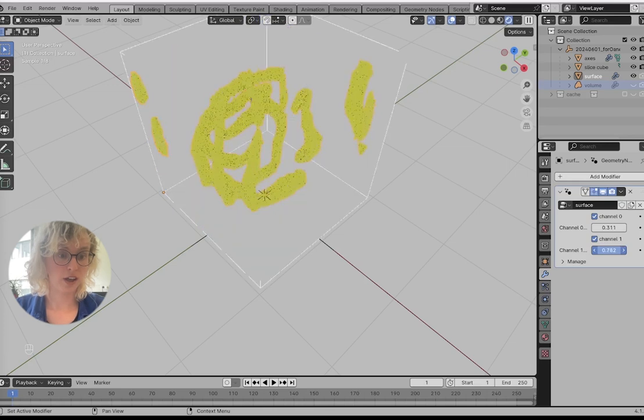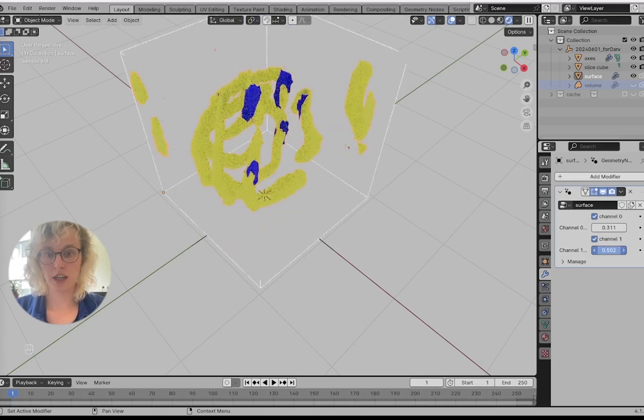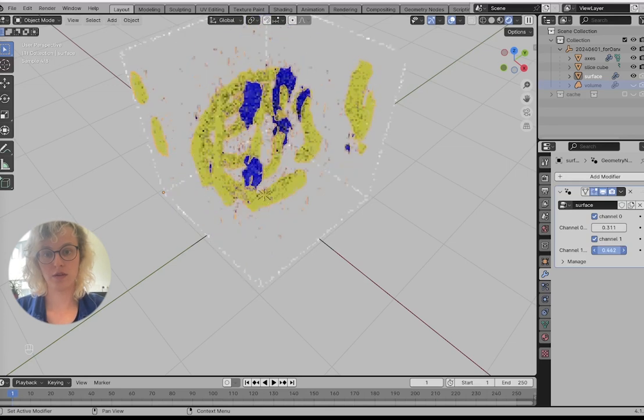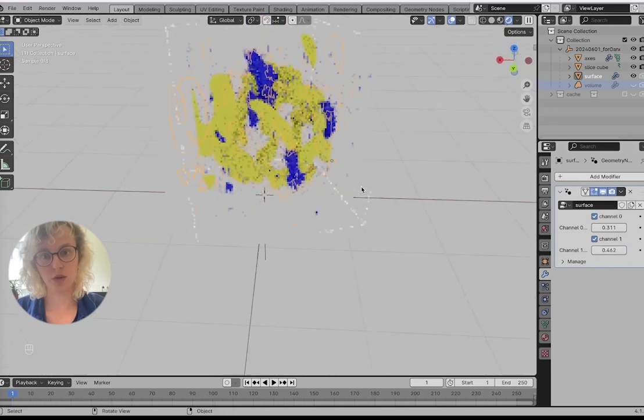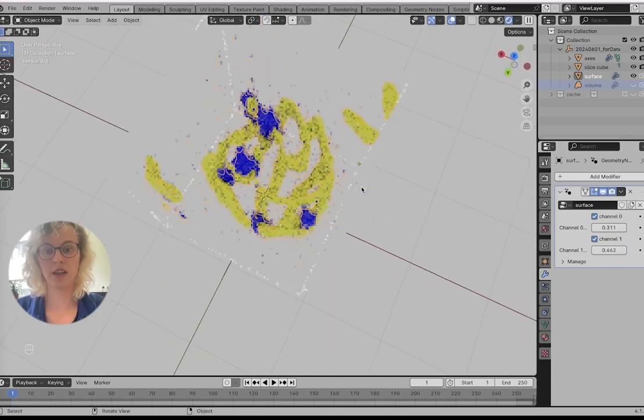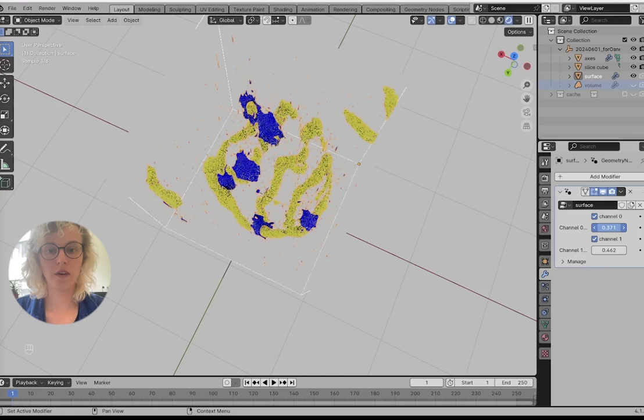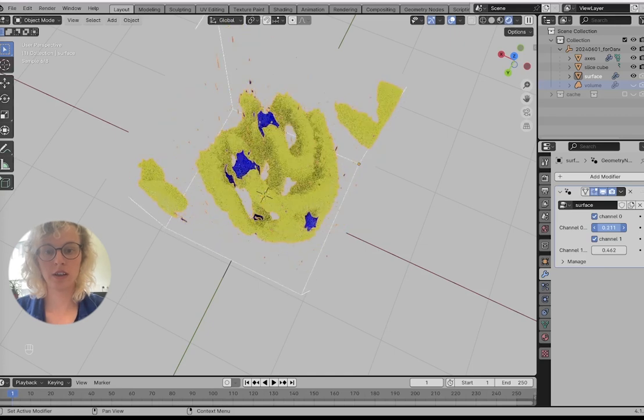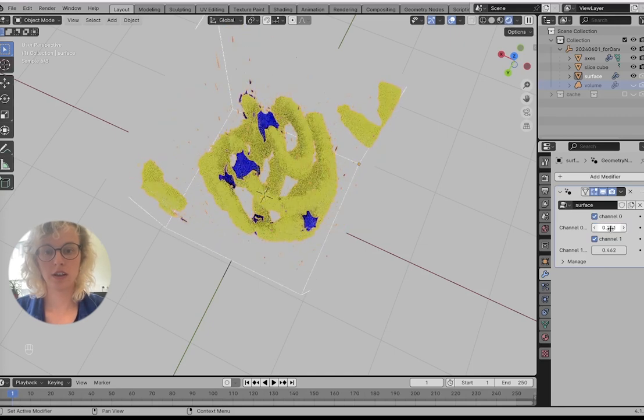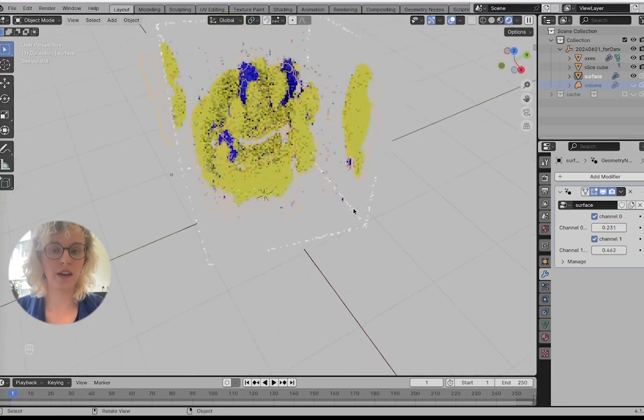We can slide this up and we can see here we have very noisy and we get to our actual spots. We can also see for our synaptonemal complexes, how they look.